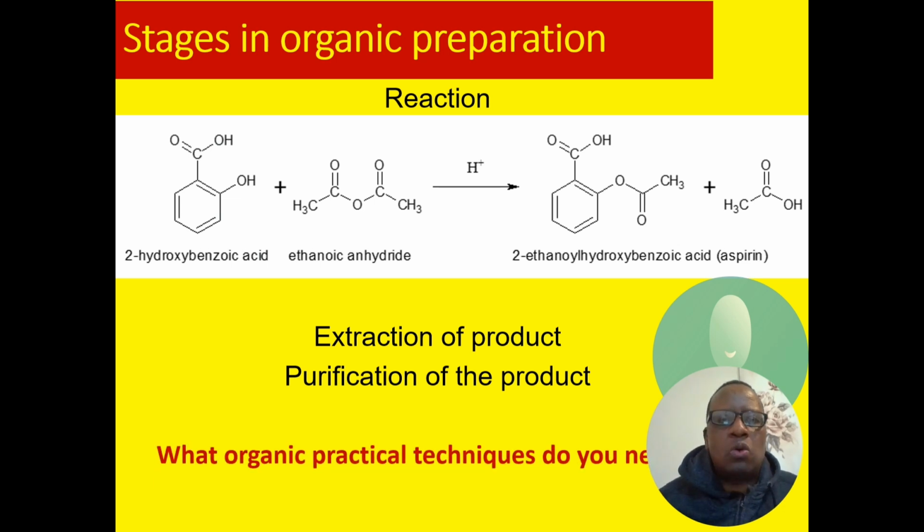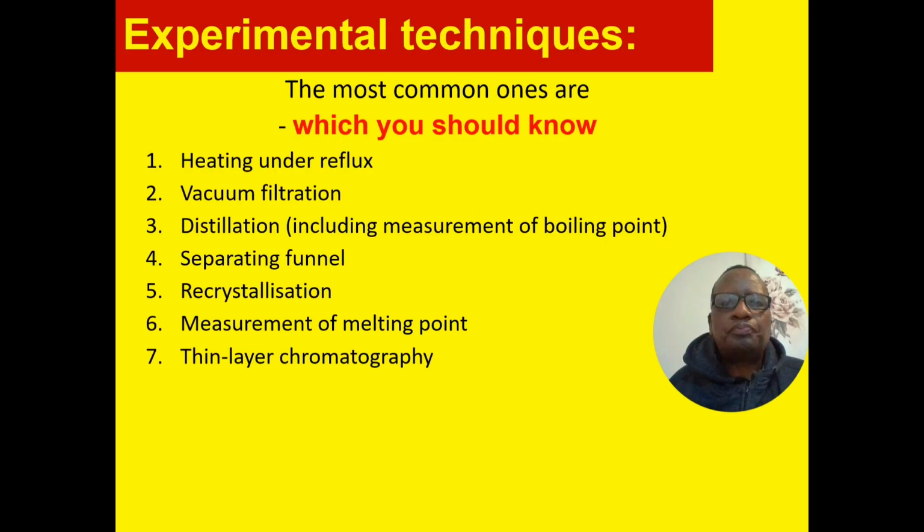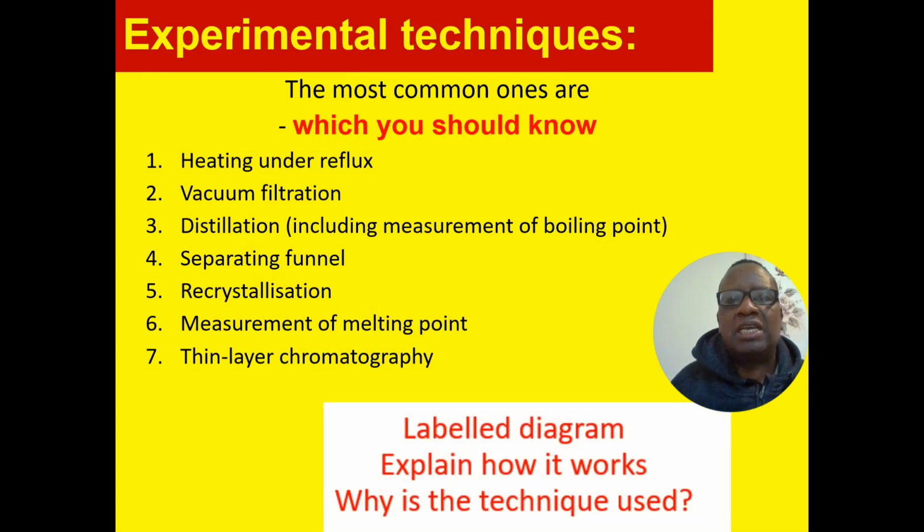What are the organic practical techniques? How many of these do we need to know? Right, we need to know reflux, filtration under vacuum, distillation, how to use the separating funnel, recrystallization, how to determine melting point, and thin layer chromatography. Sometimes they even ask you to sketch a diagram of the reflux apparatus, or of filtration under vacuum. And what I have seen is that some of the diagrams don't look like those diagrams at all.